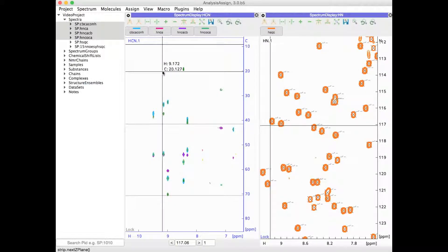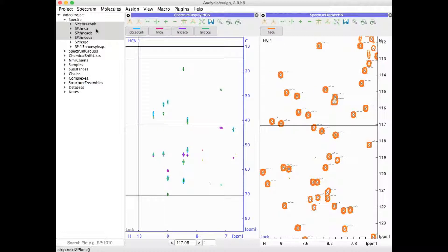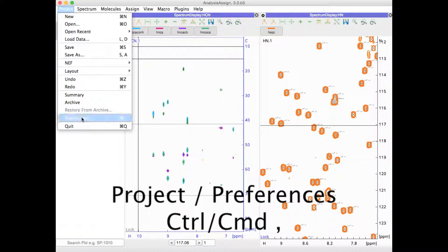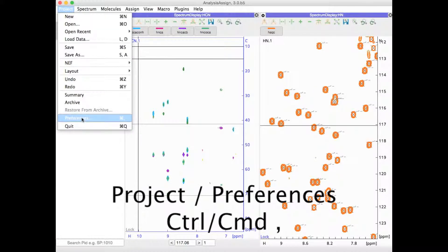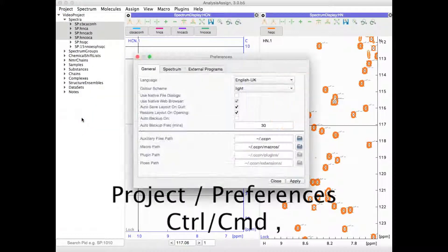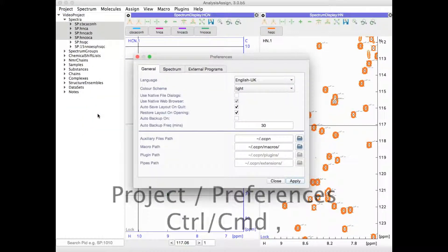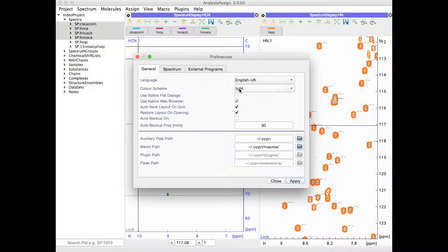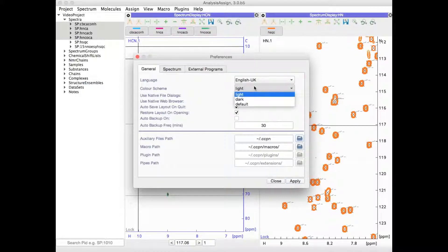You can set the background of your spectra to be either white or black. Simply go to Project and Preferences or press Control or Command and comma. Here in the General tab under Color Scheme you can select either light to have a white background or dark to have a black background.